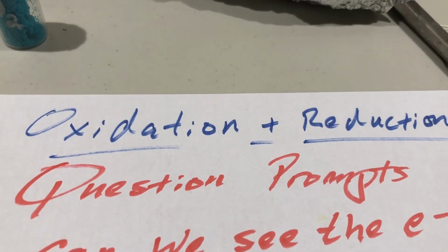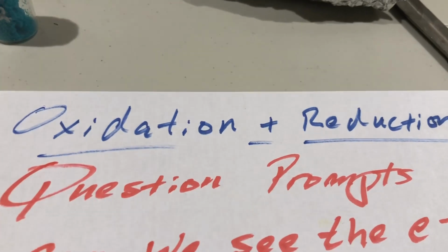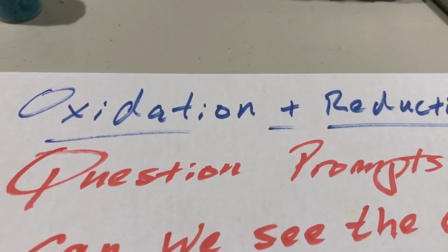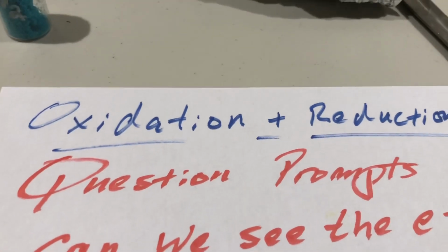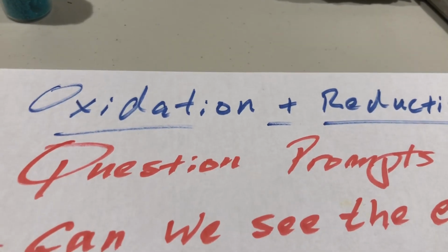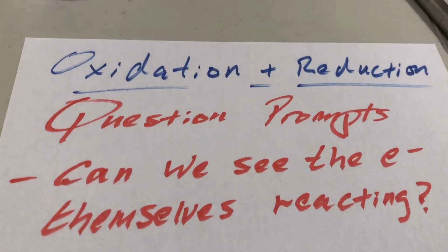Now, I'm not going over any definitions or anything in this video because all that will be done in class, but there are some questions, some prompts that I want you to think about in terms of the demo that's going to be done. It's a nice, simple demo. Now, the questions are this.